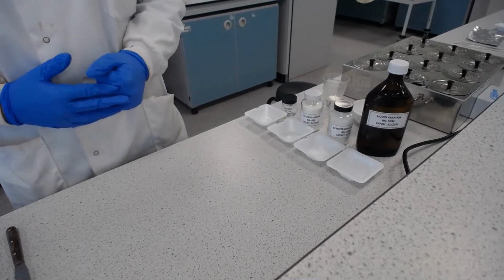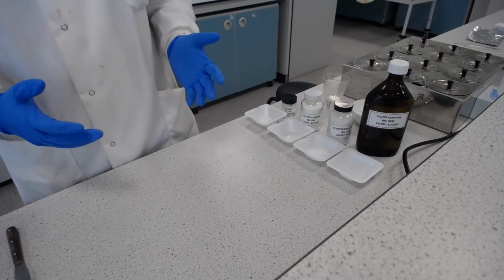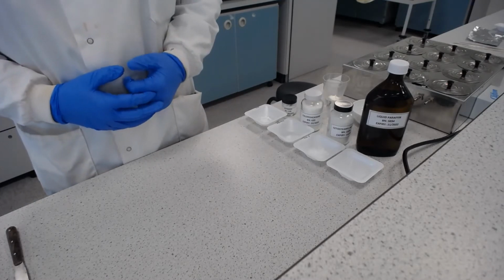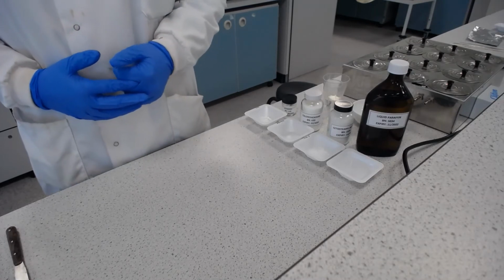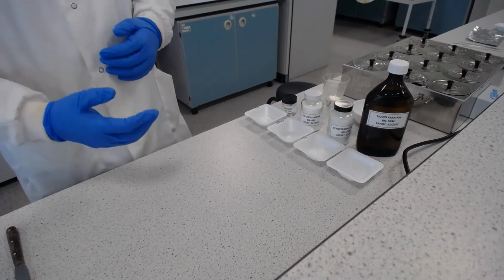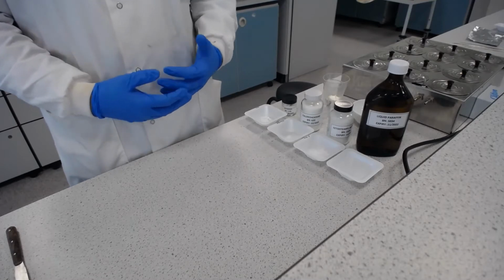The first point says complete all the sections of the product worksheet, so hopefully you've already done that. And then prepare a suitable label. Again, hopefully you've already done that, or that has been done for you. Then we've said, using the master formula, calculate the quantity of ingredients required to produce the final weight needed. So I've already done that, but the master formula that you've been given has given you to 100 grams, and we need to make 25 grams.